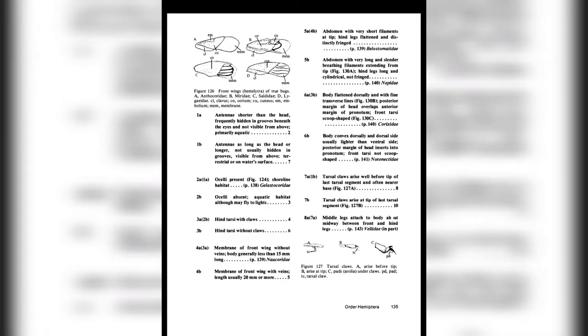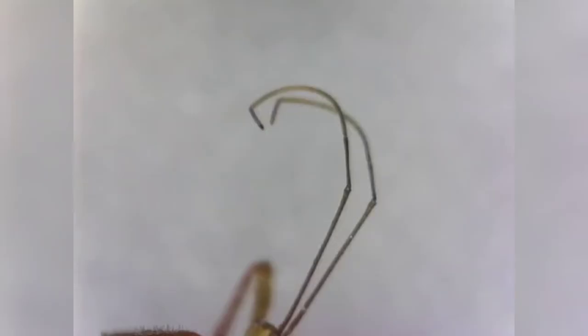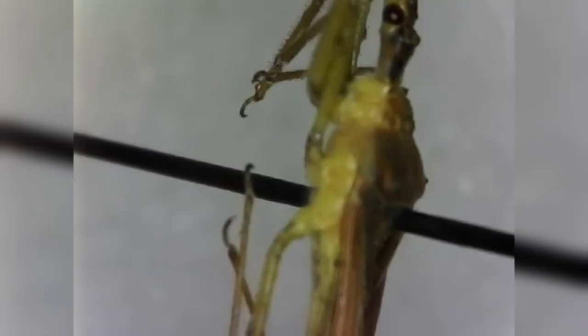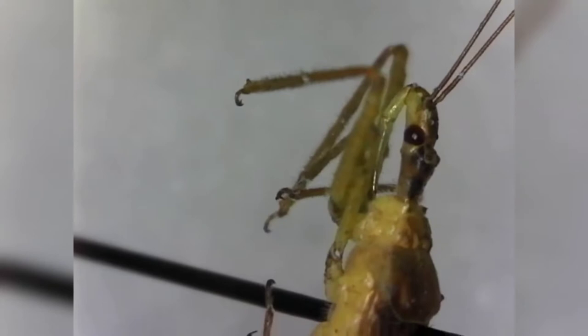Moving on, we take a quick look at the antennae. We can see they are as long as the head or longer — it's very easily apparent they're much longer than the head. From here we move on to couplet 7, which asks if the tarsal claws arise well before the tip of the last tarsal segment or at the tip. You can see here that they arise at the tip.